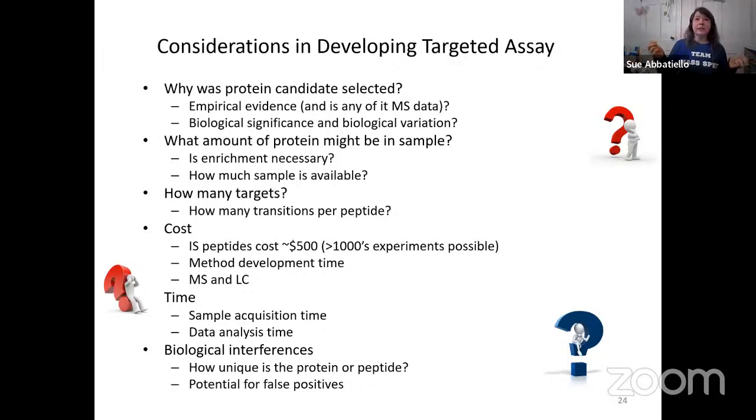And it's always good to try to go in with the hypothesis if possible. I mean, it's interesting to think about what changes cancer may cause, but you can dial into the types of proteins and interactions that are going on with cancer. You may not get it right by guessing 100% of the time, but you talk to a good biologist or cancer researcher, and they probably already have their list of favorite proteins.